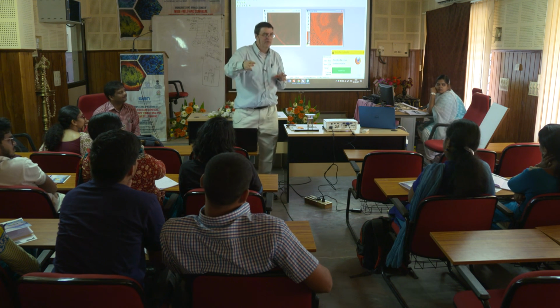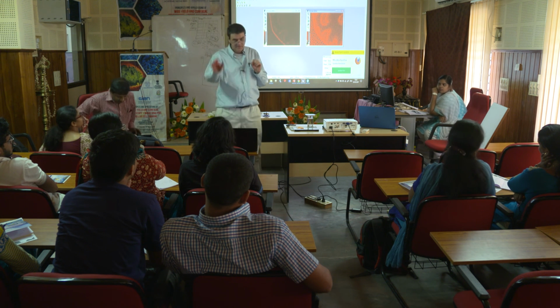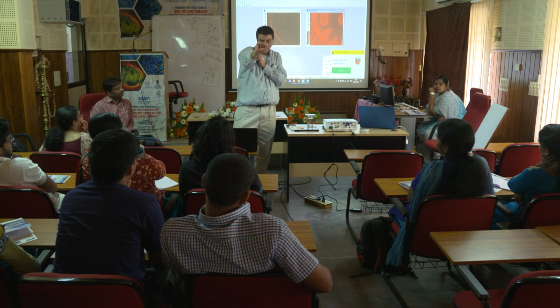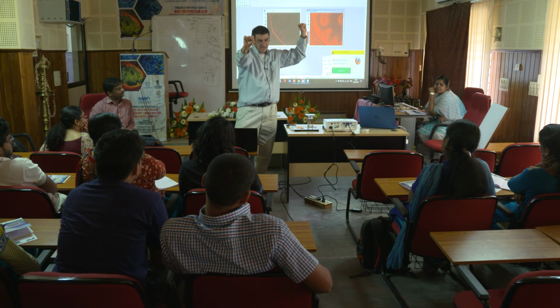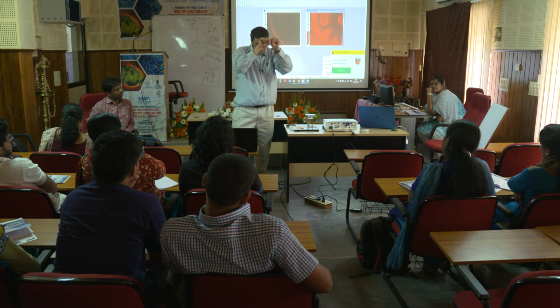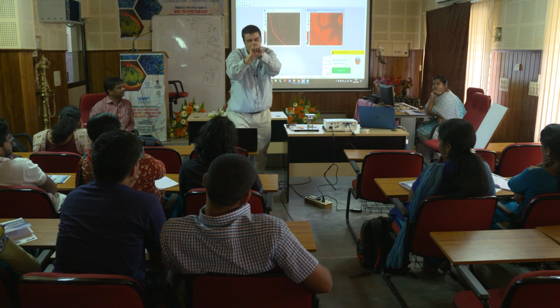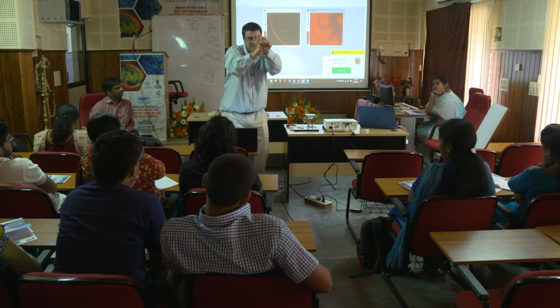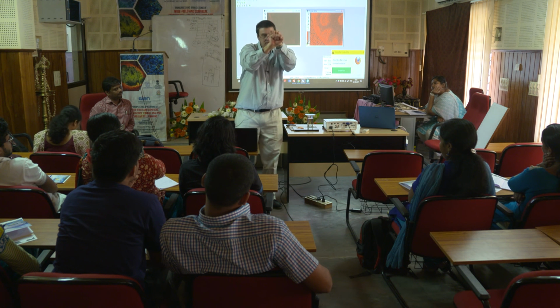So a part of that I guess I should explain, I usually use this example too. Like on a wide field microscope, if I said this is protein A, and this is protein B, right now you'd look and you'd say they're not co-localized, right? Because they're not in the same place. Now, in a wide field microscope, if I went like this, and you looked from where you're sitting, you'd say they're co-localized, right?